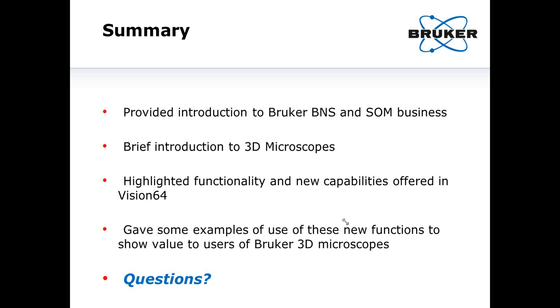So one of the first questions is, is it possible to get a circular arc segment profile instead of a linear one? Yeah, so the way that you would achieve this, if you recall how I discussed the stage automation, in the stage automation, there's the ability to actually bring in a stage file. I highlighted that in one of the videos. You can pull in a list of coordinates that would provide that arc segment profile.